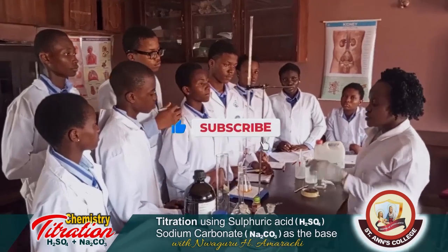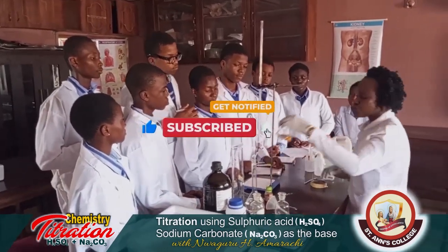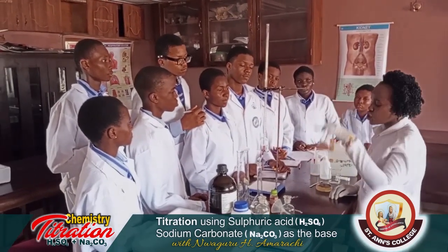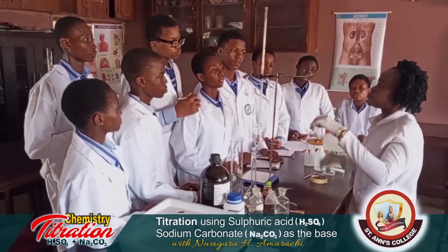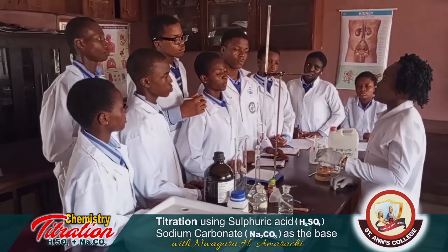Now the 2 drops is a minimum, while the maximum is 3 drops. Probably you added 2 and to you it is not clear enough to see the color change. So we make it 3. And that's the maximum. You can't add more than 3, because at that 3rd drop, you should be having a clear view of the color change.